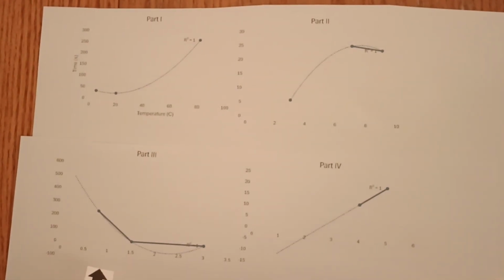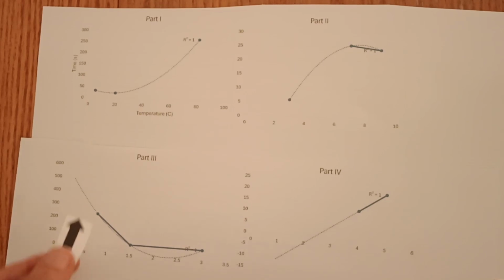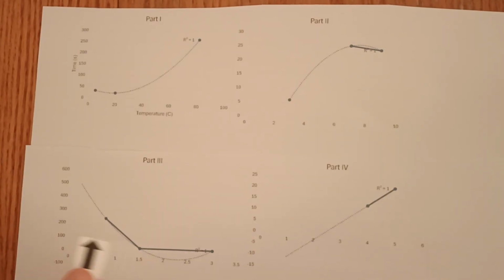For our third hypothesis, we predicted that with increased substrate concentration, the reaction rate will increase to a point and then level off. This seems to be held up by the data. Here it is slow, here it's faster, and these two are almost the same, illustrating the leveling off. And here we have no data at all because it took too long, illustrating a possibly steep curve.